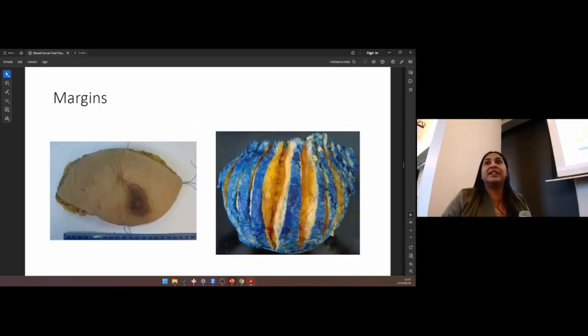They are always putting in sutures and telling us how to orientate the breast, which is extremely important, because if there is a margin involved, the oncologist would need to know, especially if it is a high-grade tumor, to be able to direct therapy in that area, or maybe even go back, okay? So Francois orientates it quite well. Our registrars are taught how to orientate the breast when we get long sutures, short sutures, and so on.